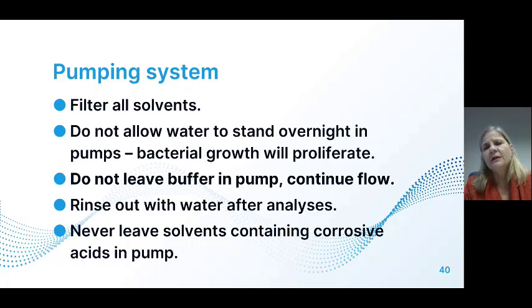You will never leave buffer in the pump. If you do not want to change the buffer, say just rinse it out with methanol or acetonitrile, you could put the buffer on a very slow flow rate of 0.1 milliliter per minute or so and keep it running and not standing, because what you can have is precipitation of the salts that are in the buffer in the pump. It's always a good idea that if you have used a buffer, you rinse it with water after the analysis, and then you never leave solvents containing corrosive acids in the pump, because obviously you would have corrosion of your pump.